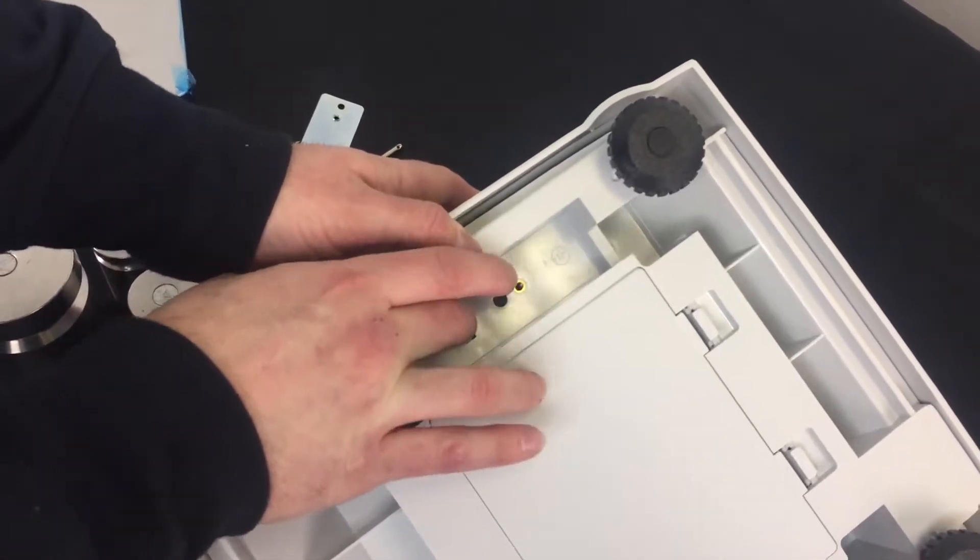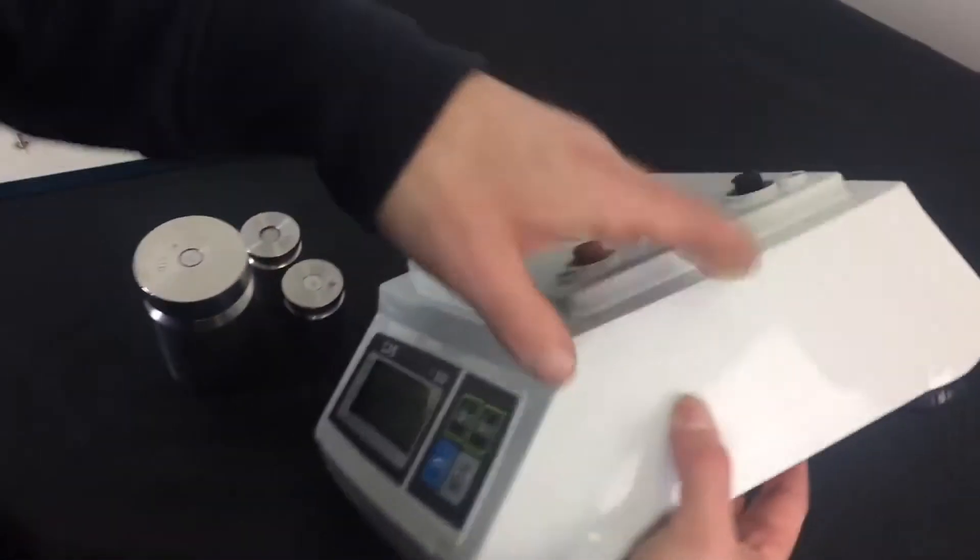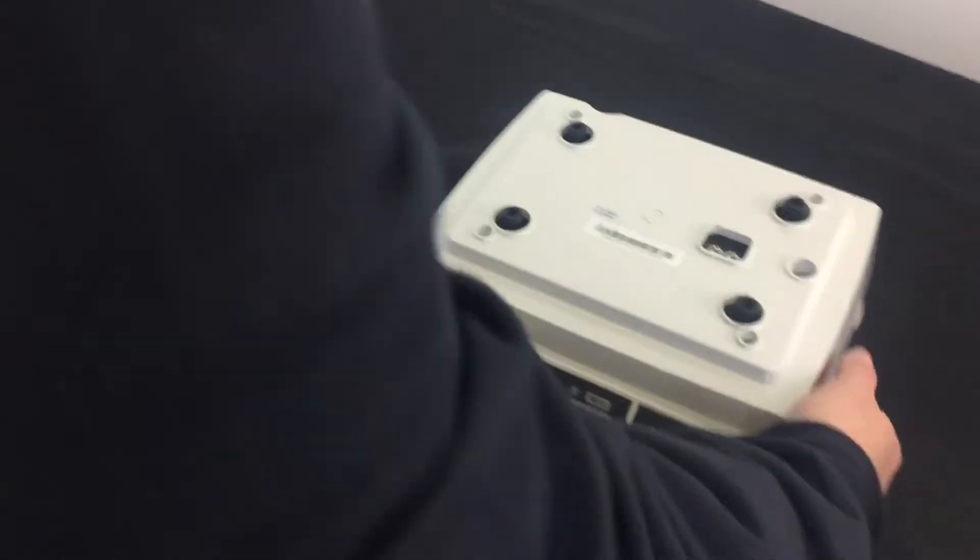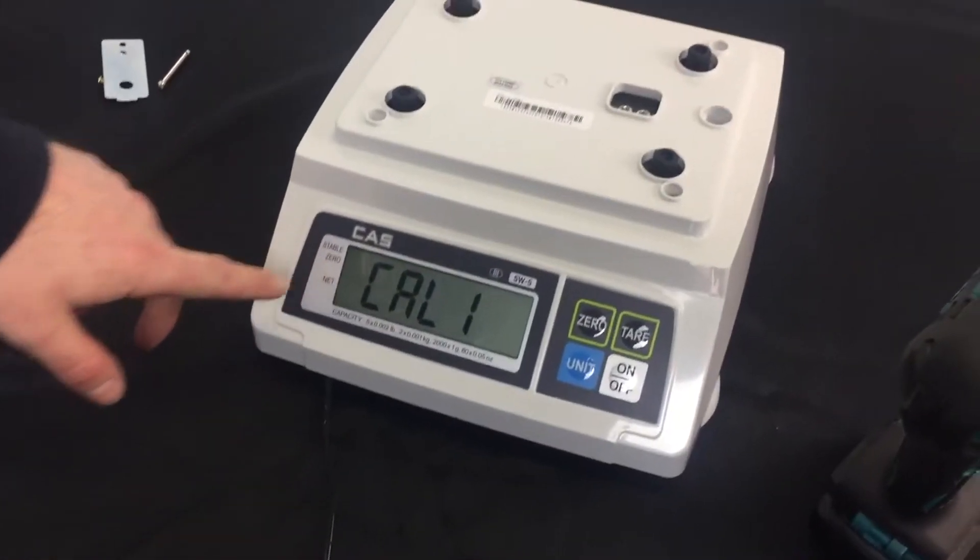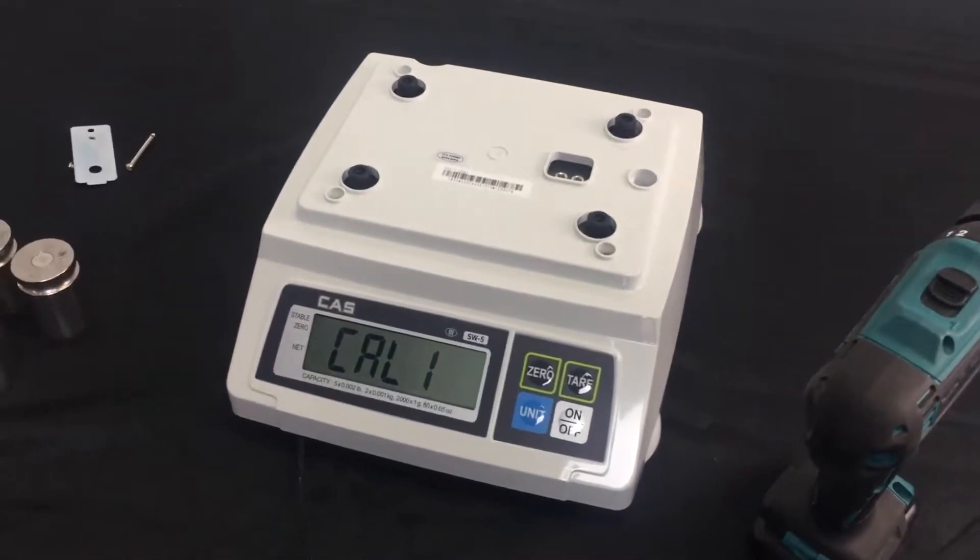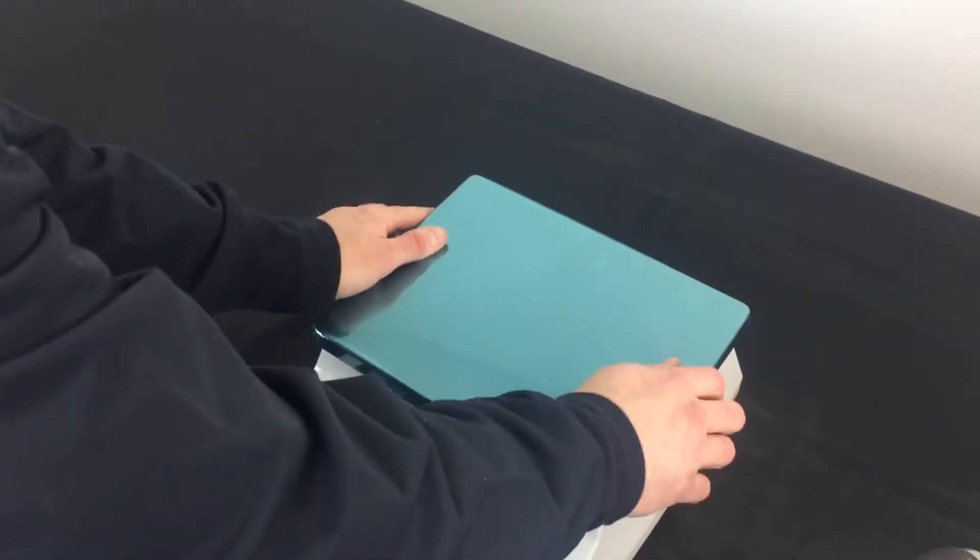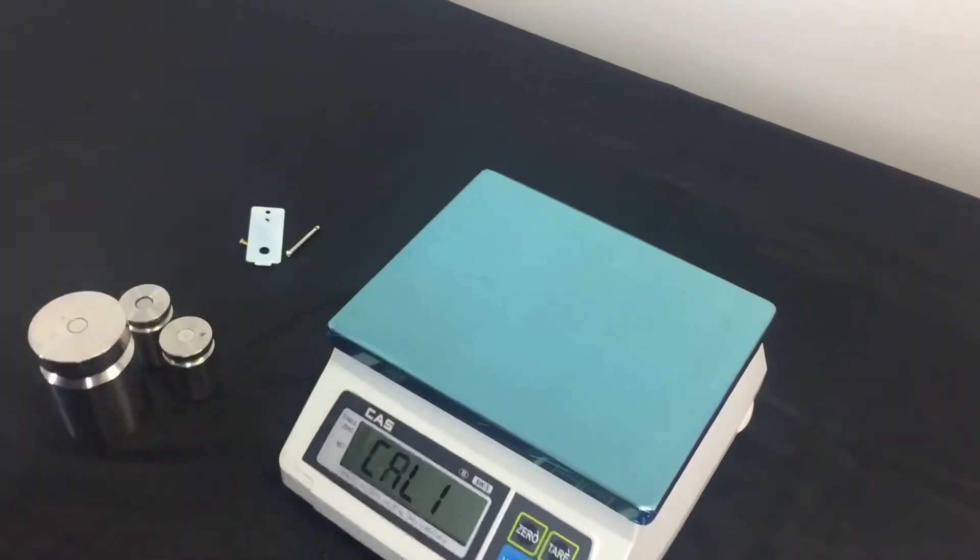So, what we're going to want to do is just hold this in, flip this around while turning the scale on. You'll see one on the display and then cal one. Now, we're ready to calibrate, so let's put our platter back on the scale. Get it in there. Secure.